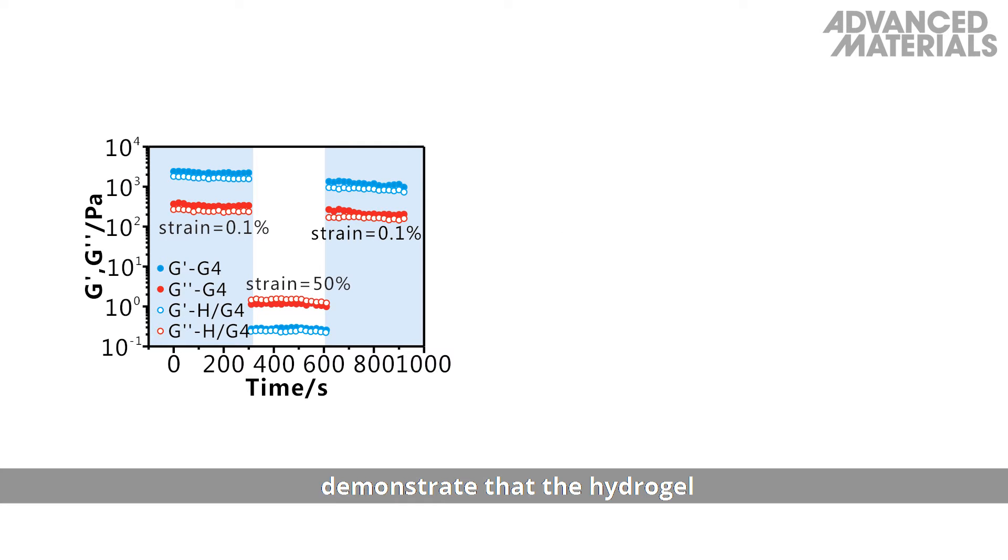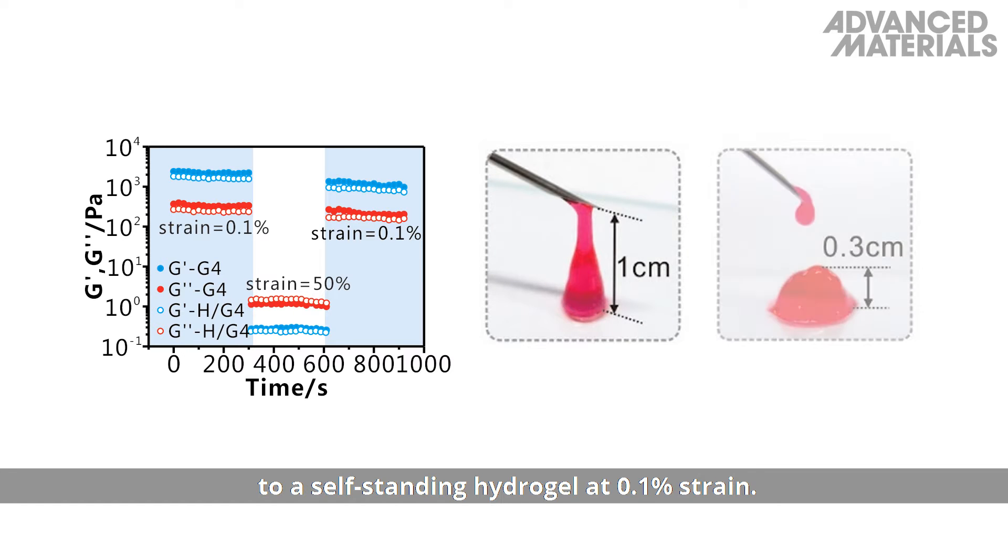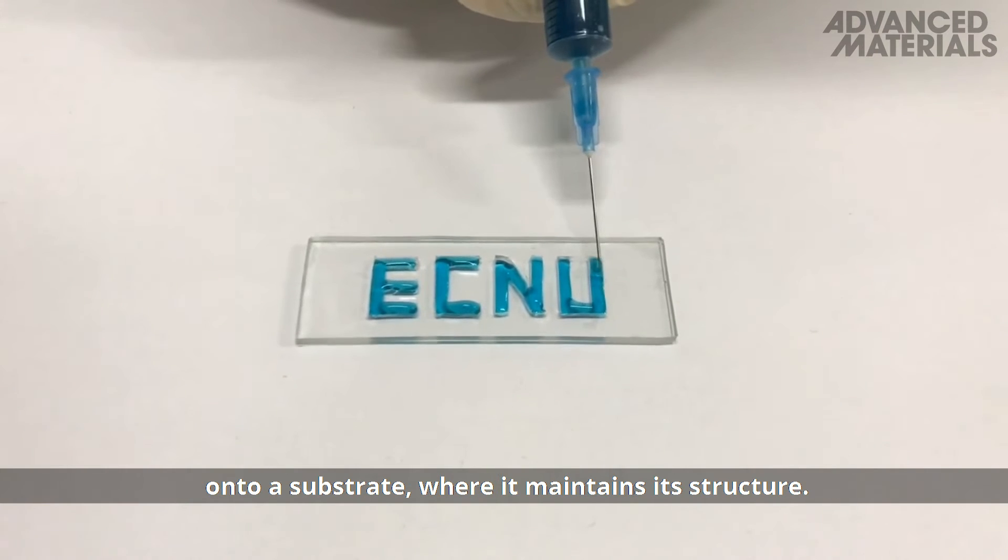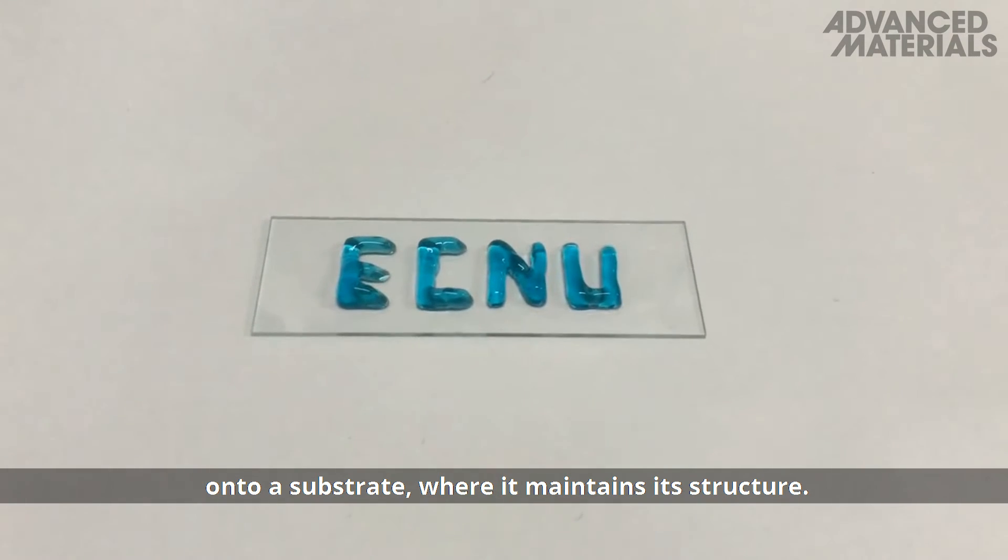Step-strain measurements demonstrate that the hydrogel could switch between a quasi-liquid state at 50% strain to a self-standing hydrogel at 0.1% strain. The hydrogel could therefore be injected through a needle onto a substrate where it maintains its structure.